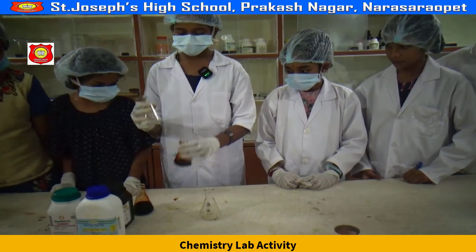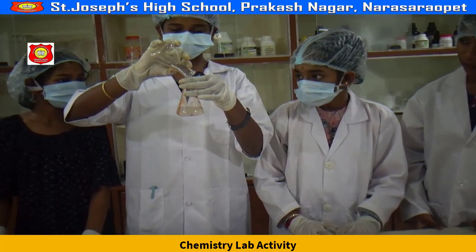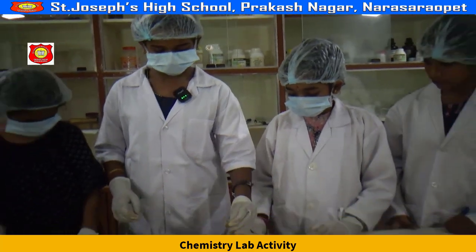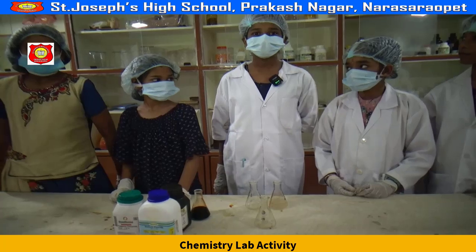Now I'm adding sodium fluoride to this. See, the color has disappeared. Now by adding sodium fluoride, the color of the fake blood will disappear.